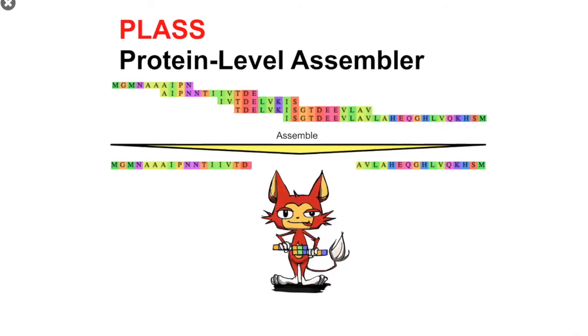As a next step, as I mentioned, one thing you could do is assemble these reads and try to figure out how well this pathogen actually assembles. For this, in this example we're going to use PLASS, which is a protein level assembler. We built it to assemble really diverse metagenomes, especially from soil and so on. But I want to showcase here that you can also use it for assembling something that is not as complex and not so difficult. Other assemblers you could use are Megahit or Metaspades. You could just give these reads to one of these assemblers, and they will also do a good job assembling them.